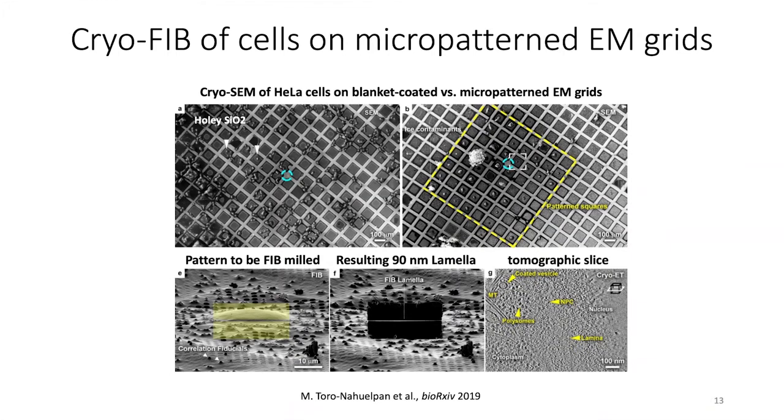In fact, and this is anecdotal, we and other researchers have found that cells in particular like to settle above the gold bars where they're inaccessible to the electron beam. I think that this may be due to the higher stiffness in those regions, but I haven't seen a study that went into this in detail.